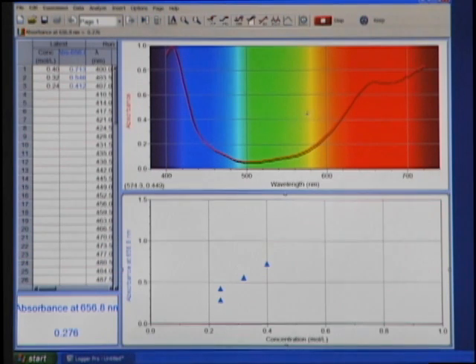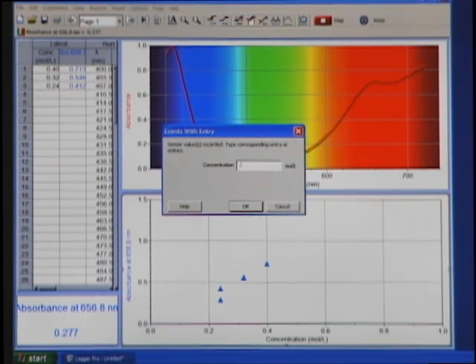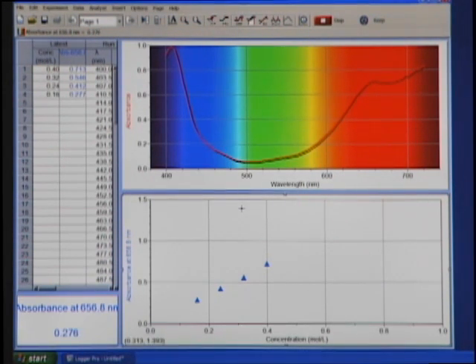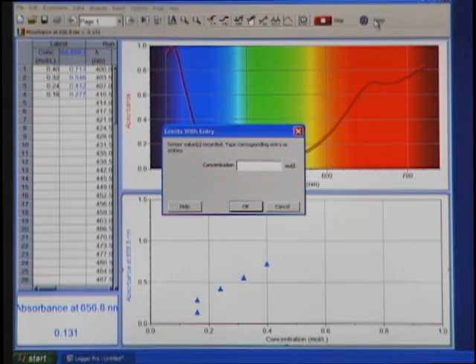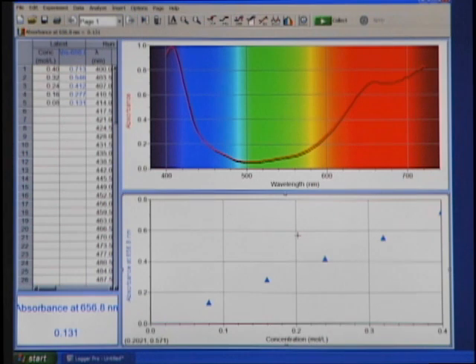0.16 molar. And finally, the last standard is 0.08 molar. And I'm going to click on Stop. And there's my Beer's Law data. Beer's Law is the relationship between absorbance and concentration.